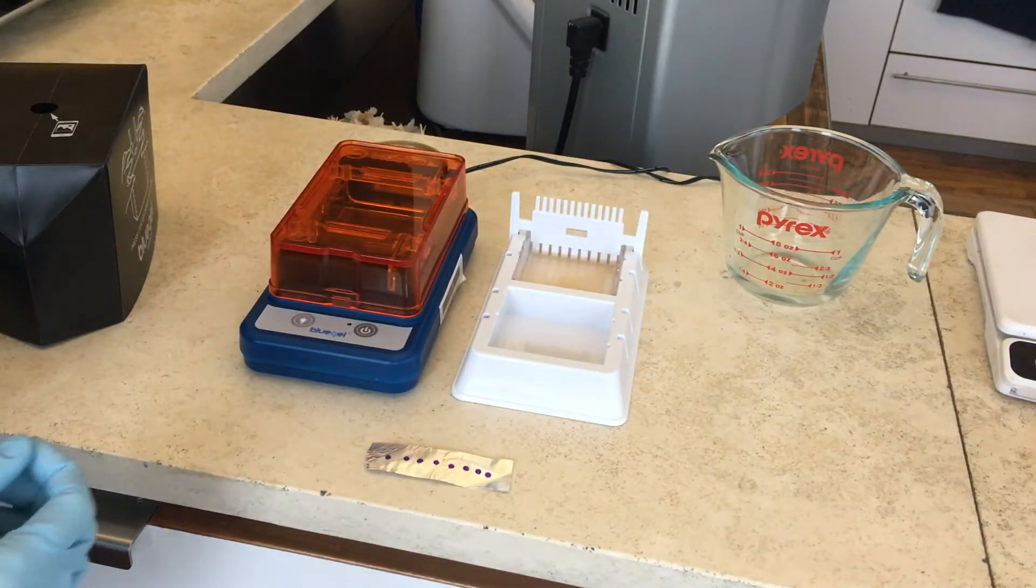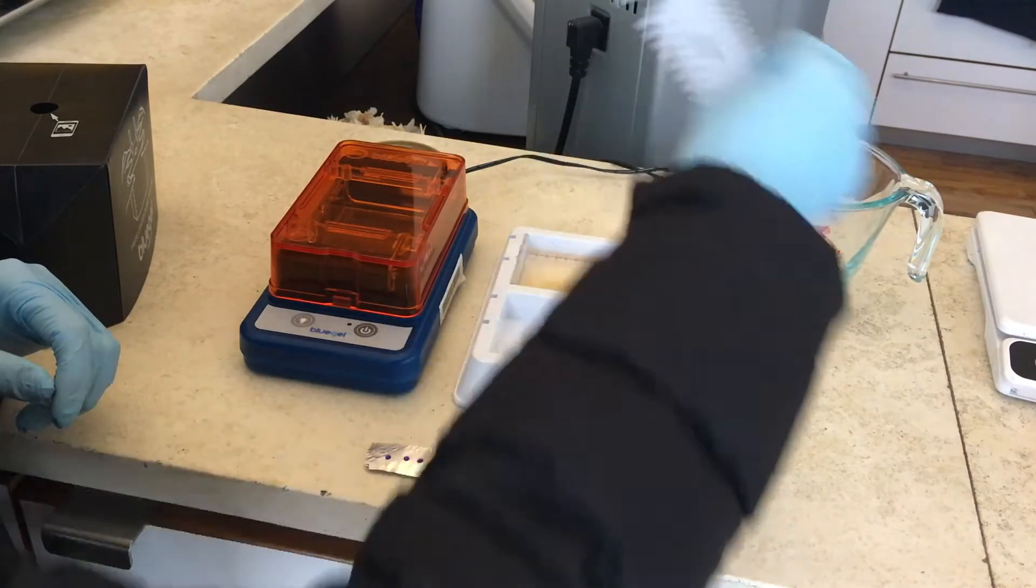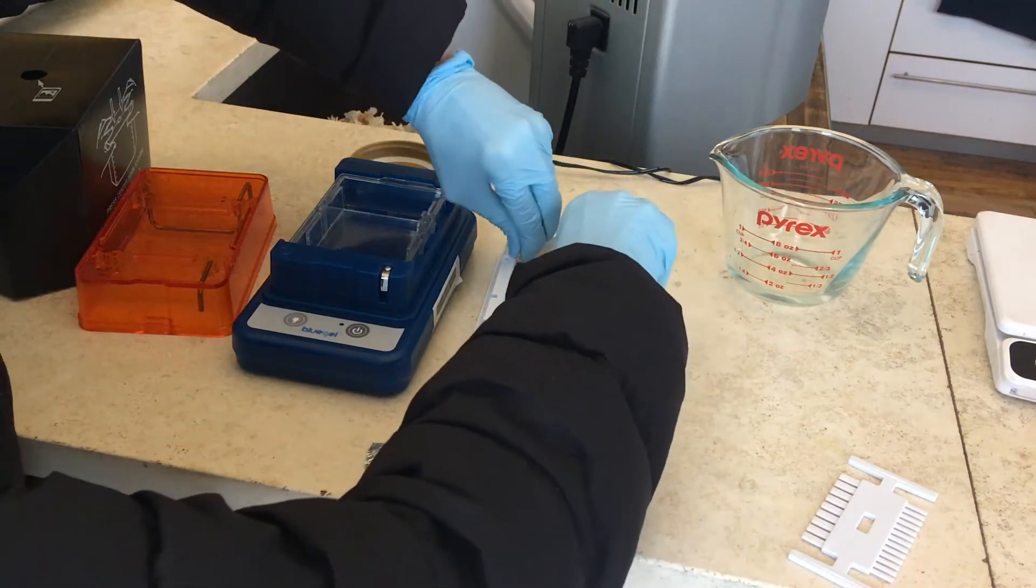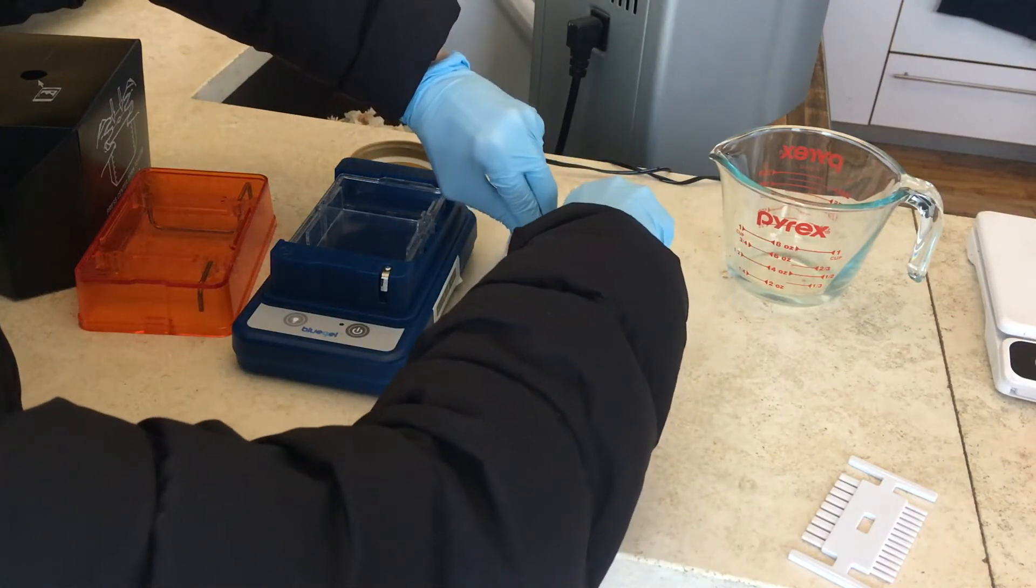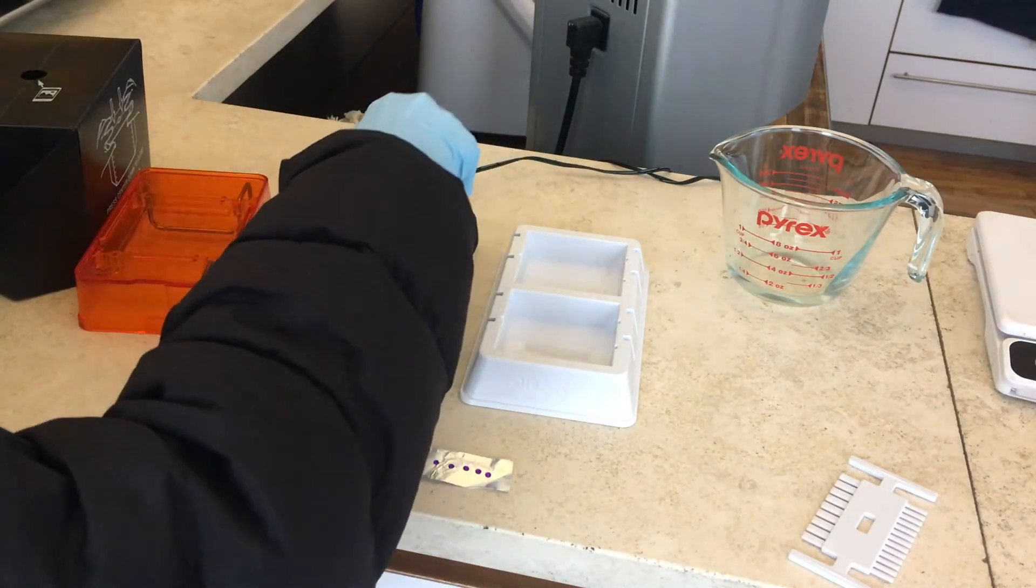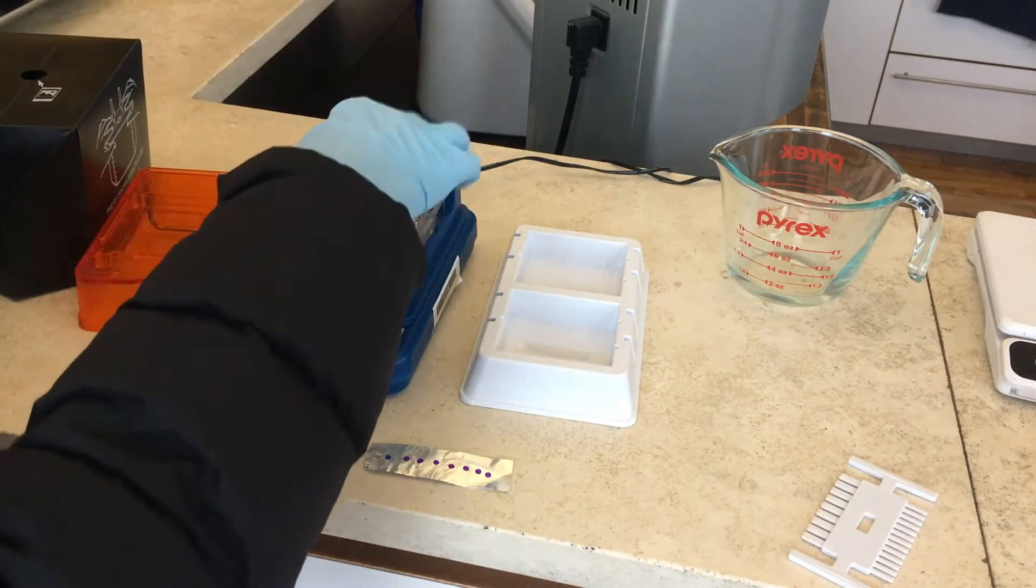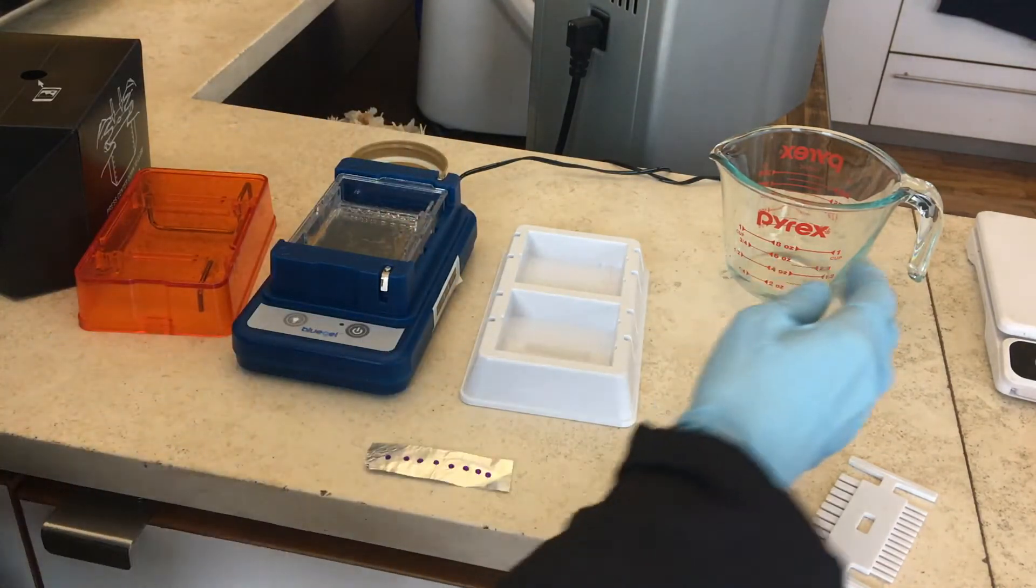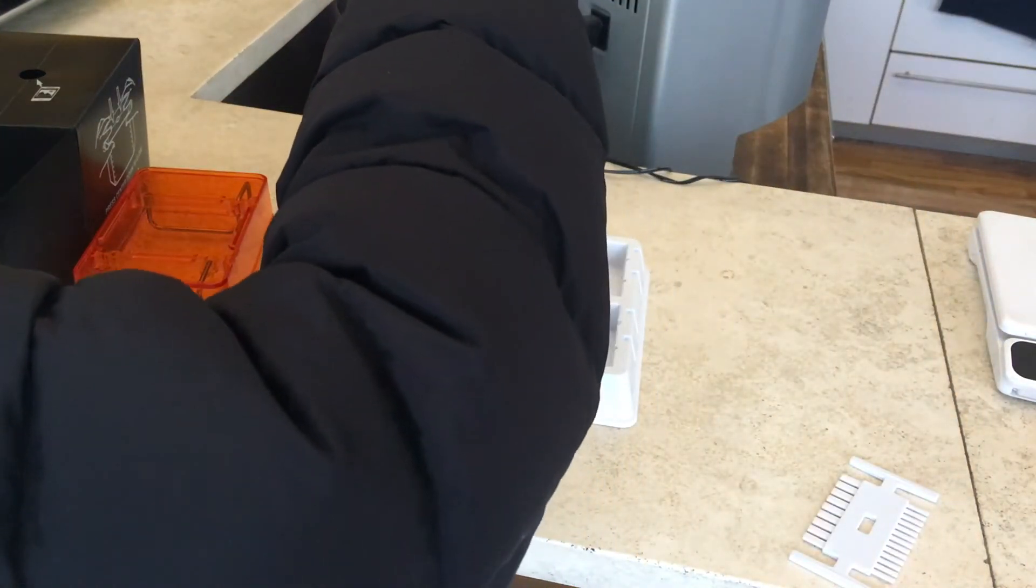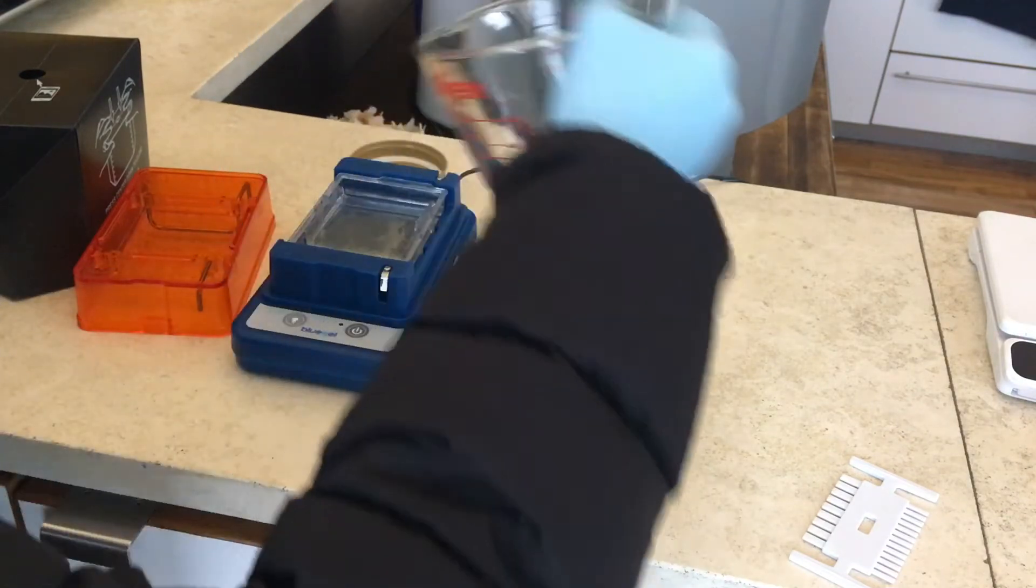Our gel should have set at this point. So what we're going to do is pull out the comb first and then we're going to lift this tray out and we're going to put it in here. There's this plastic piece that kind of slots in here and you're going to put the agar gel in there. And the next thing we're going to do is pour over some of the TBE buffer to just cover it. 30 milliliters should just cover it.